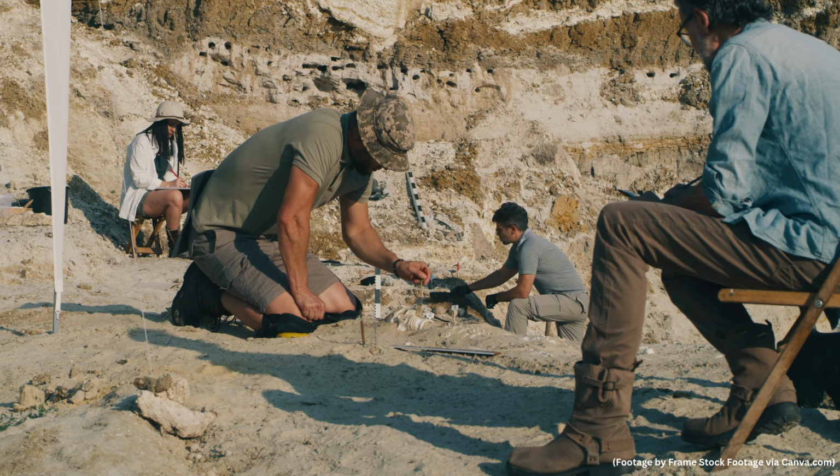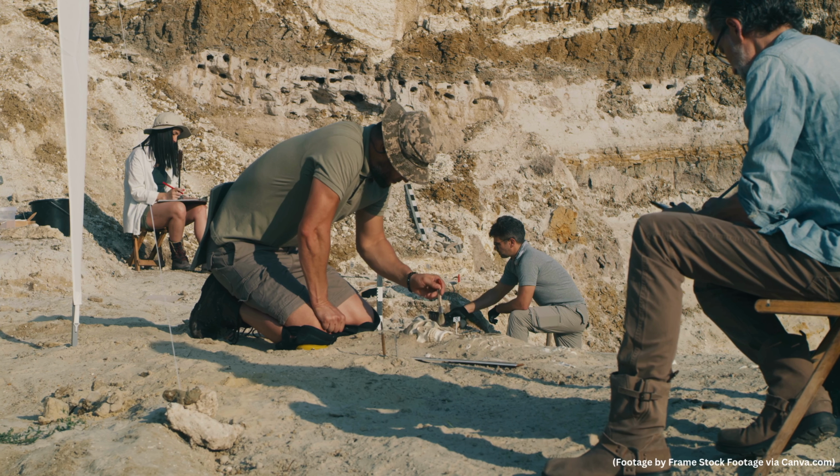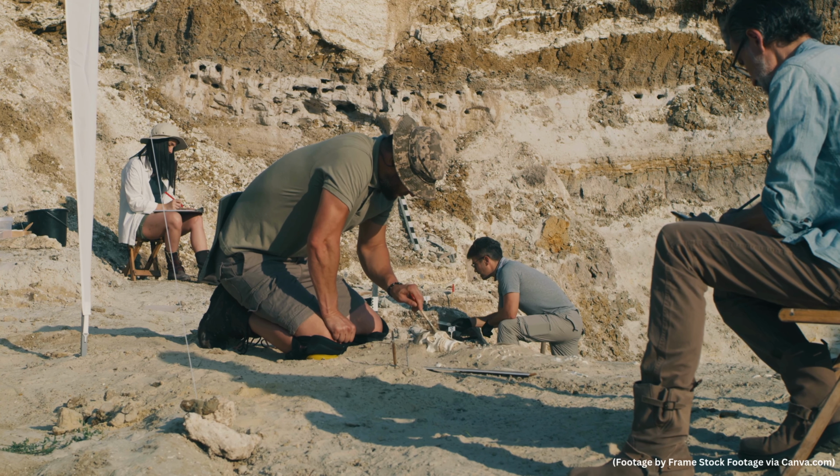The second scenario is, imagine that archaeologists are digging up human remains and they stumble across a fragmentary piece of bone, and they're not sure whether this bone comes from a male or female. So the question arises, can we use PCR to determine whether the individual was male or female? Now, the answer is yes, we can, provided that the DNA isn't too degraded.